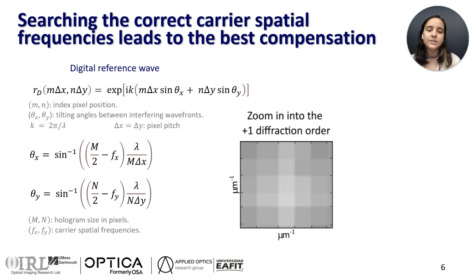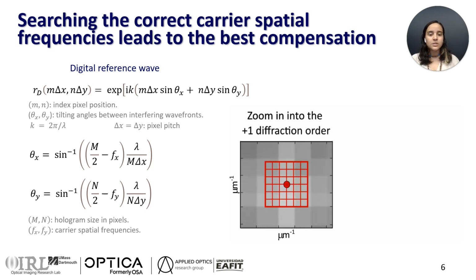as you can see in the green grid. And we perform this process all over again until there's no better compensation than the central one, the big circles that we mark here, the pink ones. And as you can see, we can mark a path that we follow for this compensation.